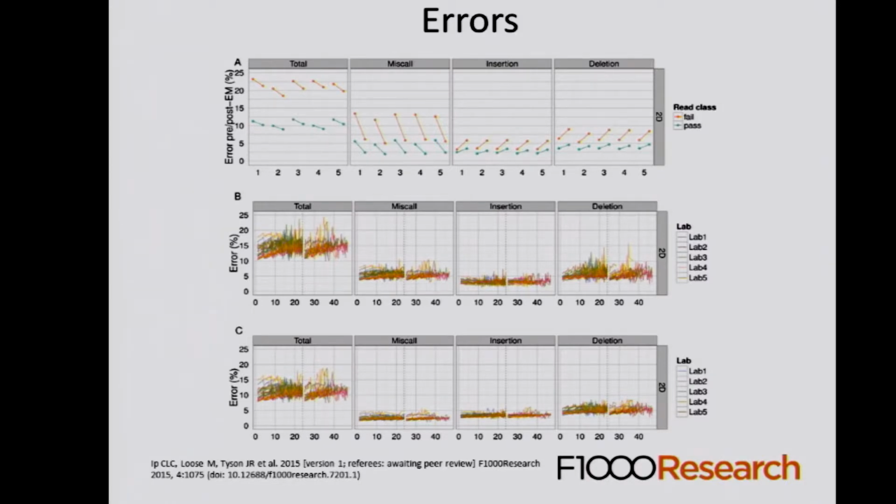That's fairly high. Certain algorithms, so that's these other points here, this is expectation maximization, we'll touch on that after the break, can really improve the performance. However, there is a sacrifice: you actually see fewer missed calls, but a slight increase in insertions and deletions when you use this expectation maximization function. But it does, to some extent, really improve the quality of the base calls to do that step.